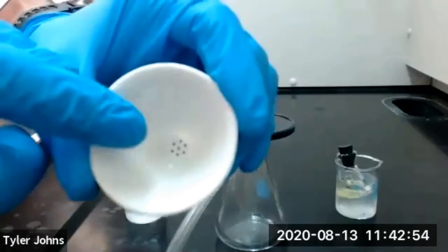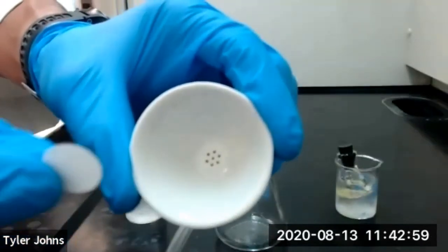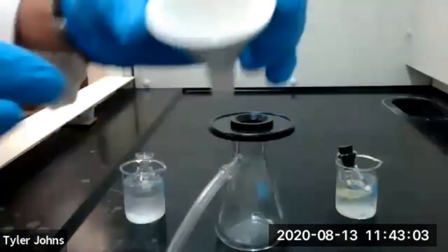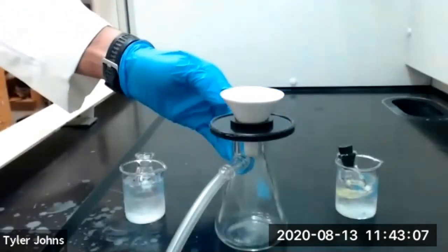This is our Hirsch funnel, and you can see there are some holes in the bottom. We're going to place a small piece of filter paper over those holes at the bottom of the Hirsch funnel, then place our Hirsch funnel back on top of our filtration apparatus.